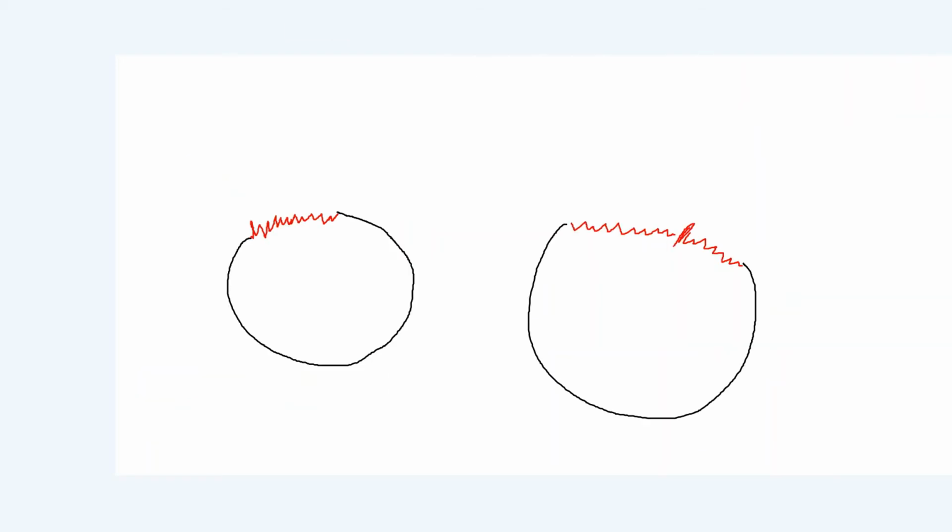So now that you know how the restriction enzyme is going to help make a clone, here are two possibilities, but there are more possibilities, of course. The gene of interest, right here in red, the squiggly line, this is your gene of interest. It has inserted into your plasmid successfully. Now, yes, this is a good plasmid, but what if the gene of interest got inserted twice into the plasmid?